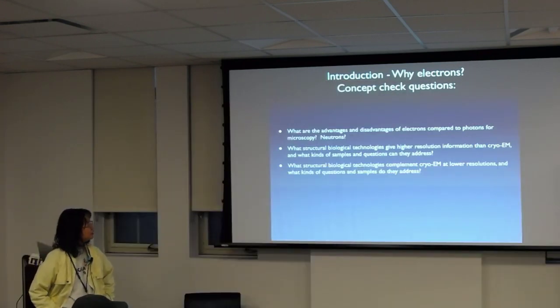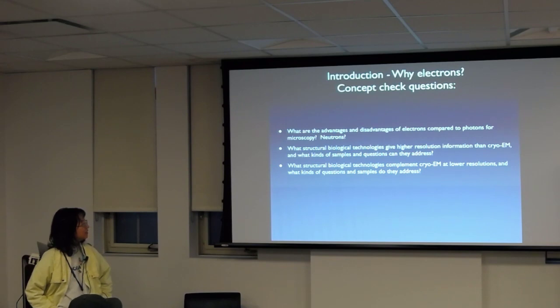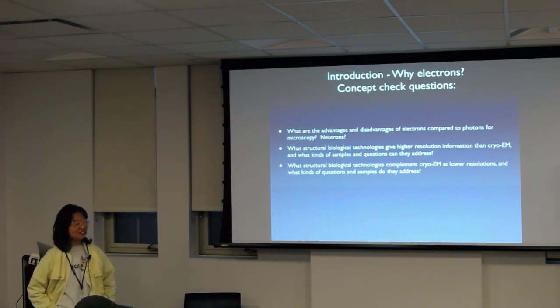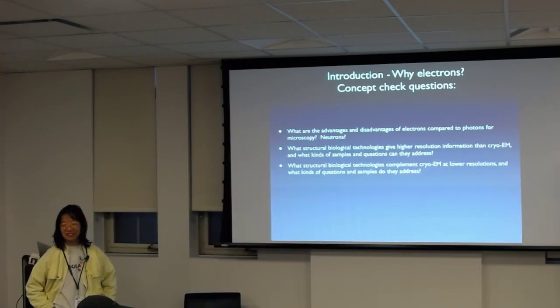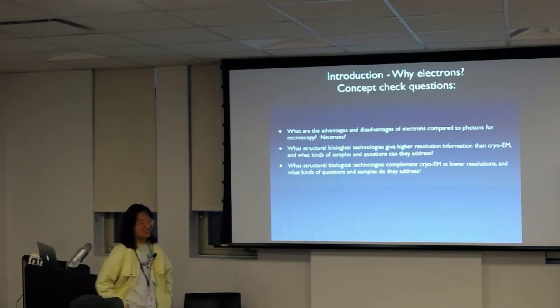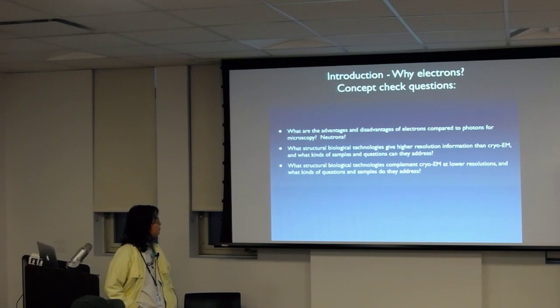What about other structural biology techniques? You can answer this. You're a structural biologist. So what other techniques get higher resolution than cryo-EM typically? X-ray crystallography is the classic one. There's one more that doesn't get as much love as I think it should. When you guys went on the tour, you saw it next door. It was the NMR. Yeah, just NMR fans.